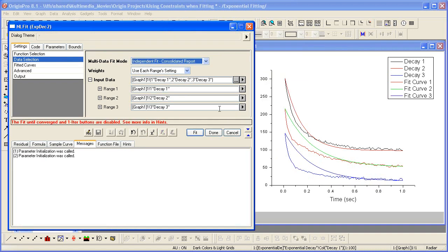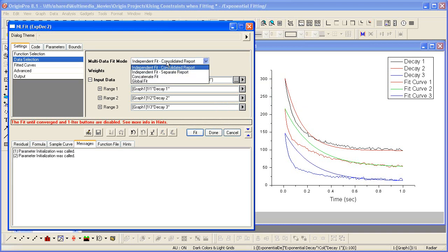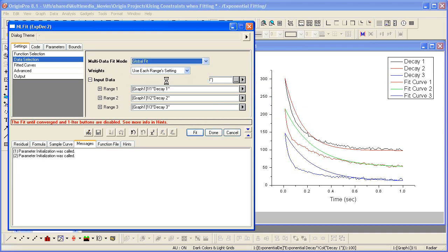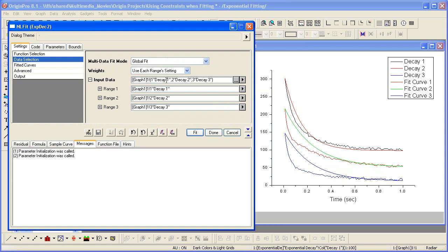You'll now see that we have three input ranges. With multiple ranges, we can specify the multi-data fit mode. Let's do a global fit. A global fit will fit all datasets simultaneously, allowing parameter sharing.